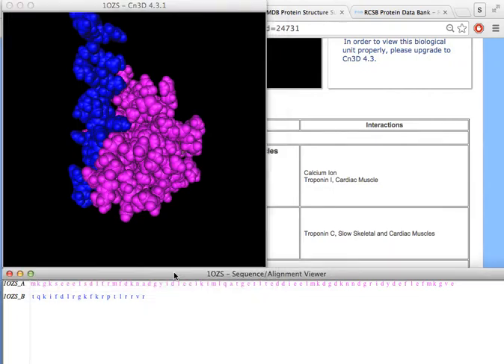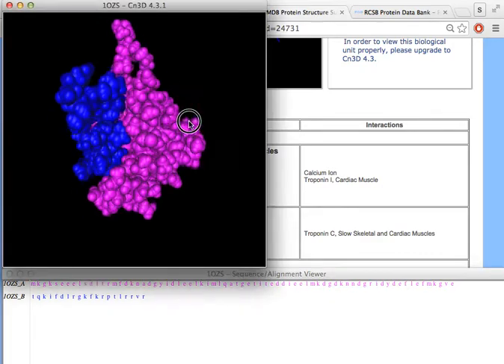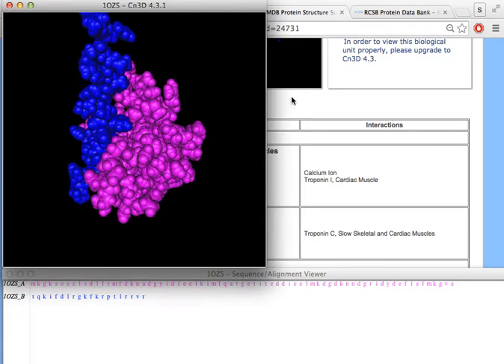Next, down below here, we actually have the amino acids that are visible here. Keep in mind that not the entire protein is visible in the structure. Oftentimes only fragments are used for the crystal, or only certain fragments crystallize well in a stable manner to be viewed. So we do not have a complete troponin I or complete troponin C here. So you're going to have to look for the region that was mutated in your case.